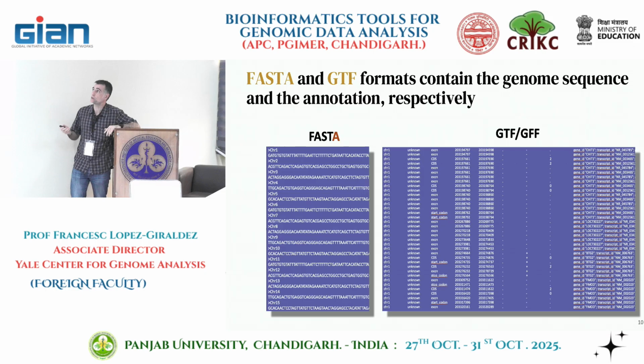So these are the annotations of the human genome, stored in a tabulated table. I know it looks quite complex, but you remember the BED file, right? Same idea. You get a chromosome, a start and end position, and it tells you what is in there. It's an exon.